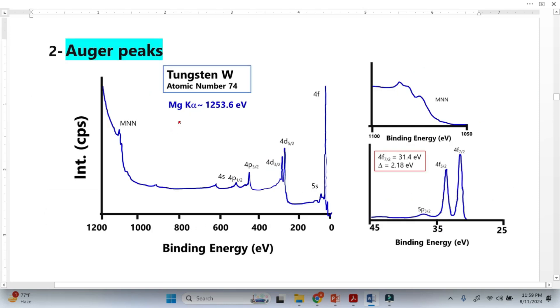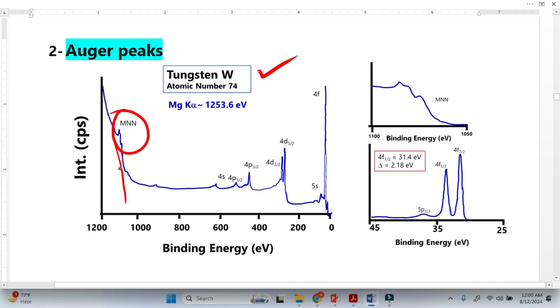If you look into the survey spectrum of tungsten, the Auger peaks are basically located at higher binding energy. For every element, in most of the cases, the Auger peaks are located at higher binding energy. This is one sign of the Auger peaks — they will be located at higher binding energy, never at lower binding energy. The second important identification is that they will not be sharp; they will be less intense.